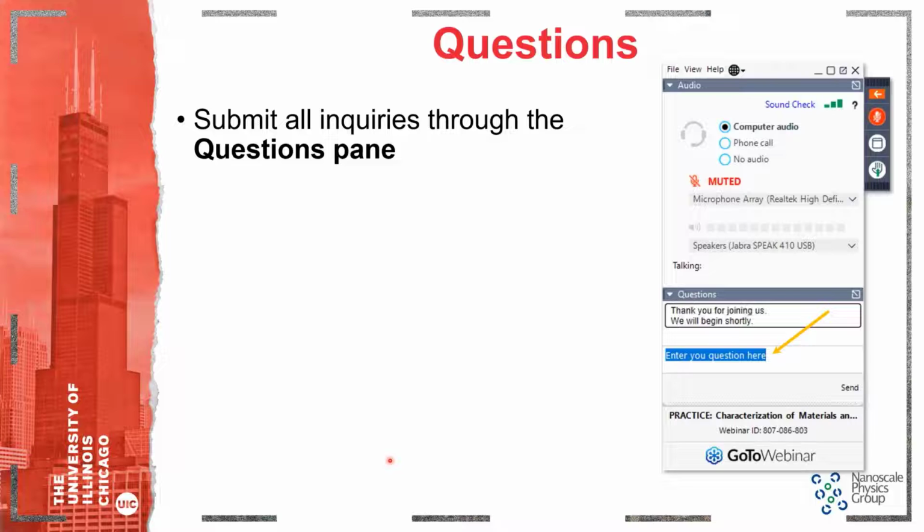Great, thanks. We had a question come in for Daniel regarding the magnesium battery cathode materials. Could you give some information about how those samples were prepared? So I'm not quite sure about the preparation of the sample at this point, because I have to contact the person who made them. But I think it was sol-gel, as far as I know, and the composition is something like MgCr1.5Mn0.5O4. Okay, great, thanks.